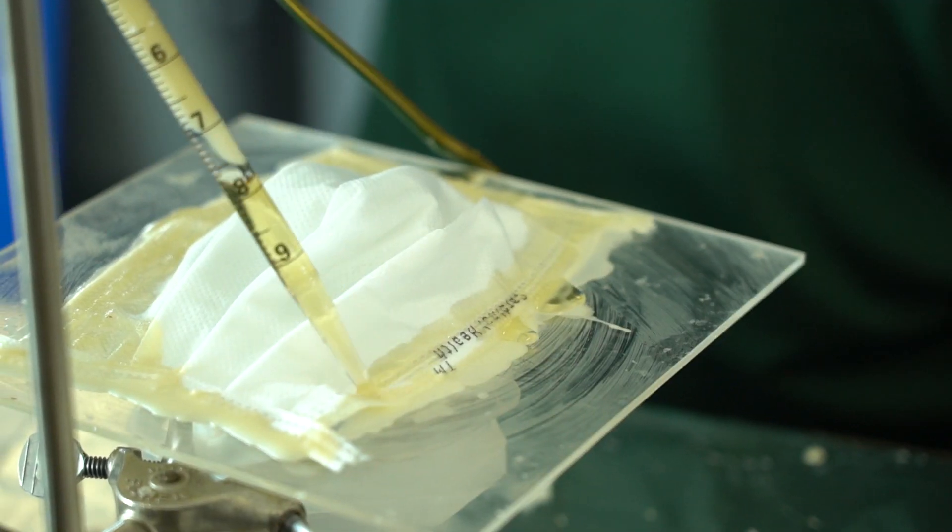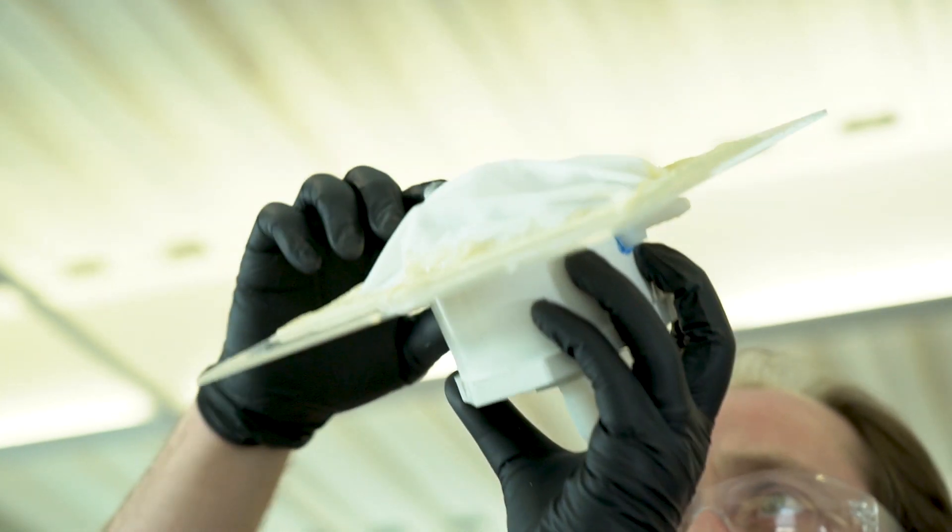I feel very proud that we get to do this work. We're going to be testing a wide range of masks.